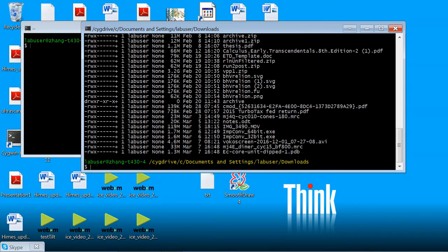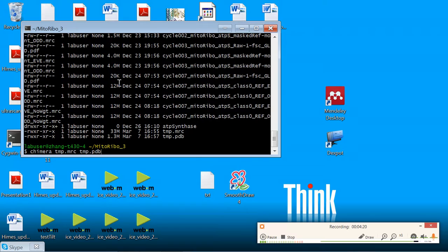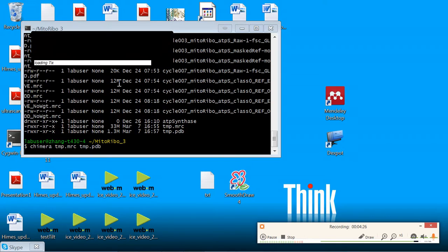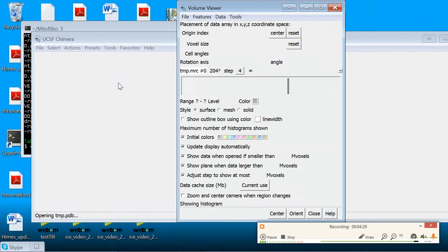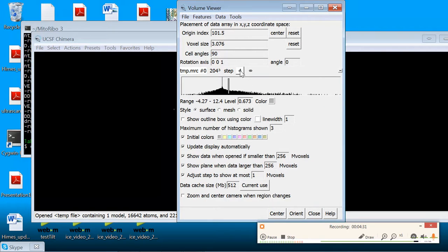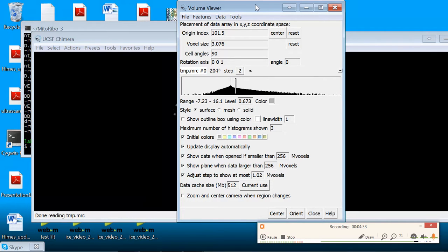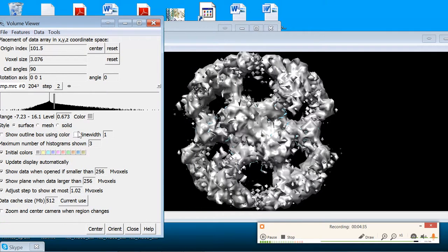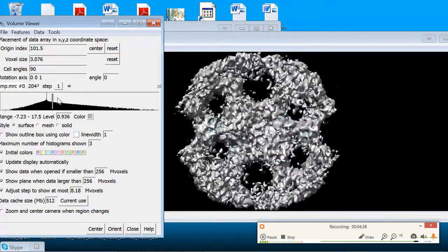And pause this because I don't know where I saved that stuff. And now that I've tracked down where I saved that, which can be a pain with Chimera, it's kind of goofy with what most recent working directory it saves. So pay attention when you save it. If not, you can reopen Chimera and just act like you're going to save it again and see. So all we want to show here is that what we did actually is a persistent change. All the headers were saved appropriately.